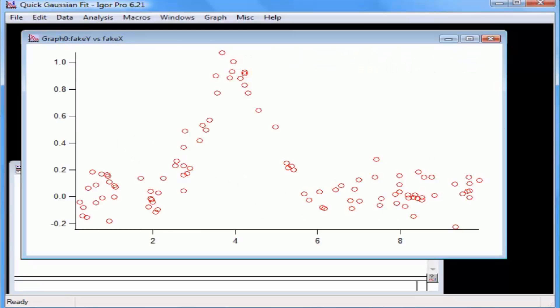In the last tutorial, I created synthetic data with a Gaussian function. Now let's fit the data to extract the parameters. There are two ways to access Igor's fitting functions. The first is to open the curve fitting dialog, which displays all the options for curve fitting, and the second is to use the quick fit method.